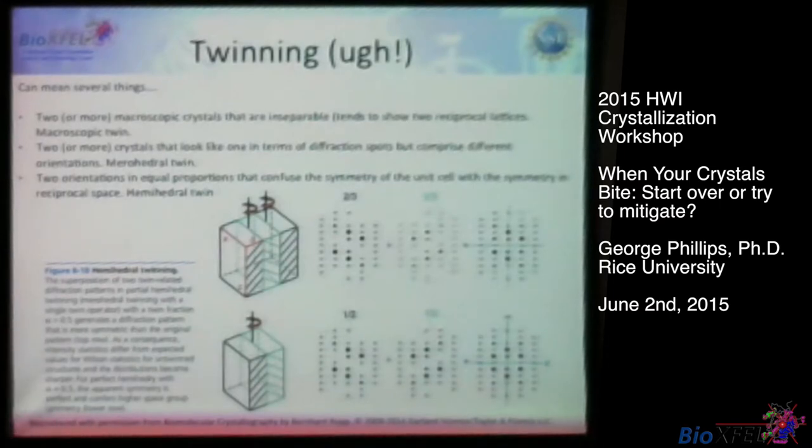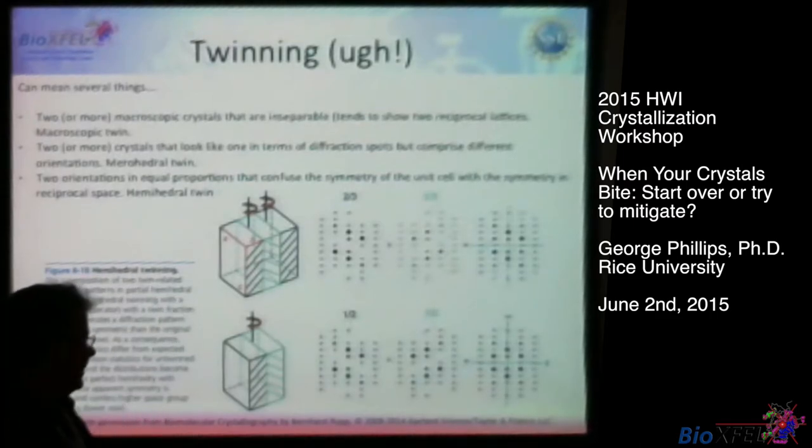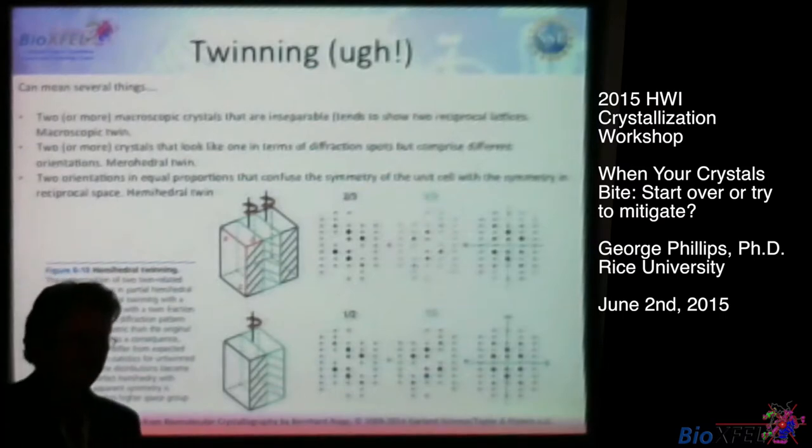Yes. And there's one other opportunity where crystals are perfectly fine and hold on to the intensity. Yeah, right. So there's also an indexing ambiguity, right? You can have separate single crystals that are this orientation and this orientation, and sometimes your program indexes them like this, and sometimes your program indexes them like that.